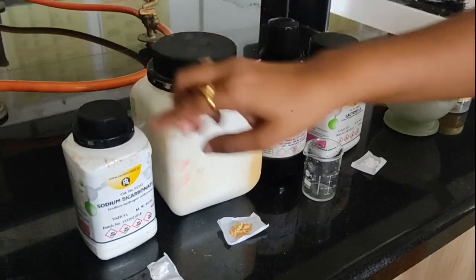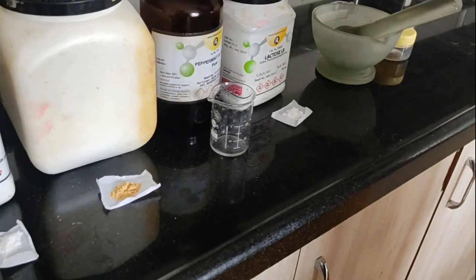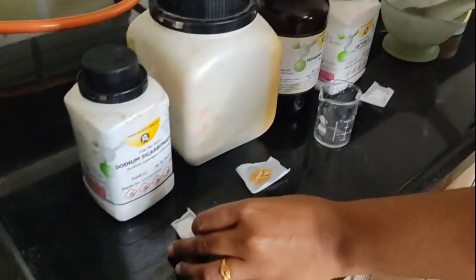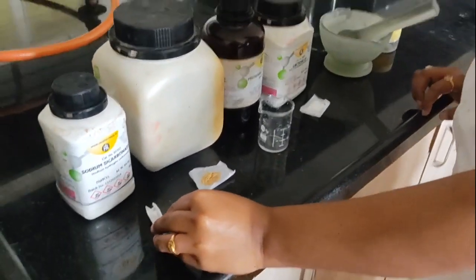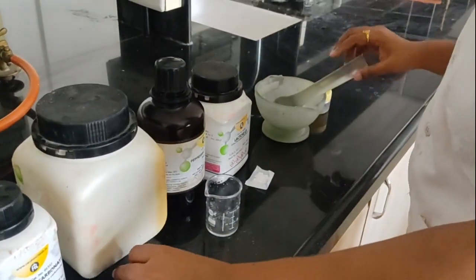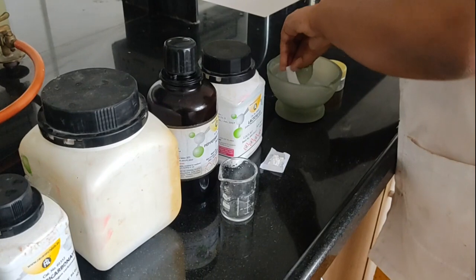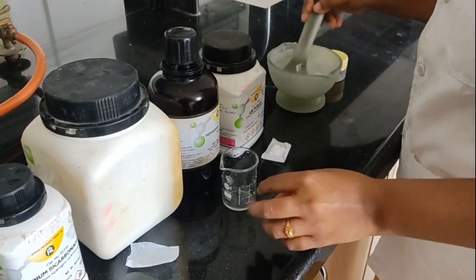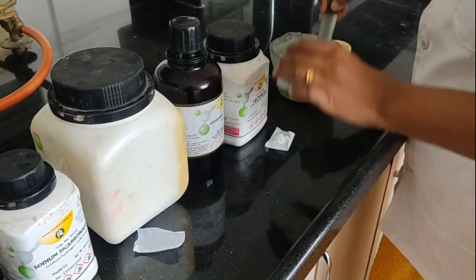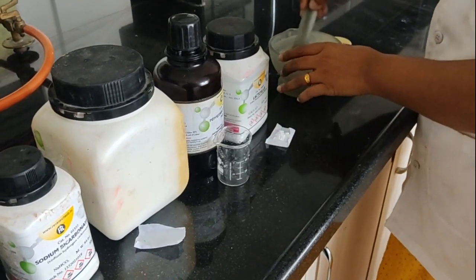So we have sodium bicarbonate, which is previously weighed. This is rhubarb powder. This is peppermint oil, which is taken into this beaker, and this is lactose, which is used as a diluent. First of all, I am going to take this sodium bicarbonate into this glass mortar and pestle. After that, I am going to add this rhubarb powder into it and properly triturate both the powders. After that, I am going to add this peppermint oil into it. Again, properly triturate it.